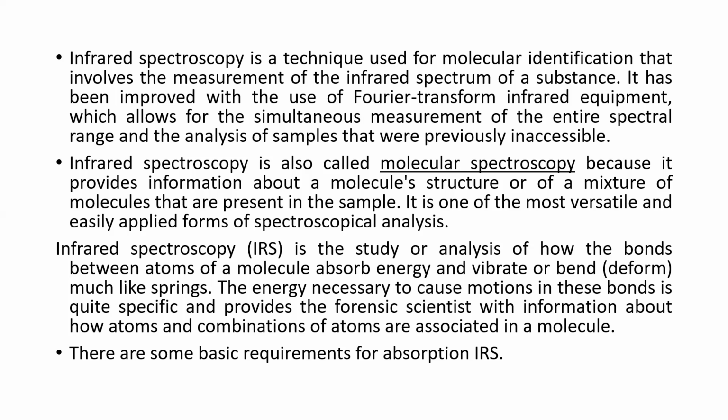Say, variation with a single functional group or a single hydrogen bond or a single type of bond, that is whether it is C double bond O or it is CHO or COOH or CO, keto, aldehyde, alcohol, CO and H. All these three atoms come together in this, but different types of bonds are there between these three, right? When we say keto, C double bond O. When we say aldehyde, CHO. But when it is CH and O, three atoms you consider in a different arrangement, COH, it becomes alcohol, right? So to get this kind of information, we take help of IR spectroscopy.